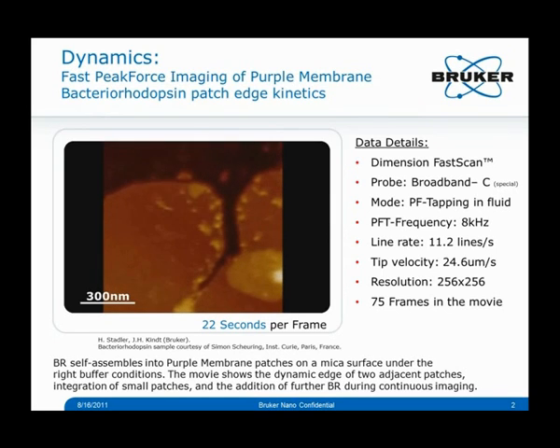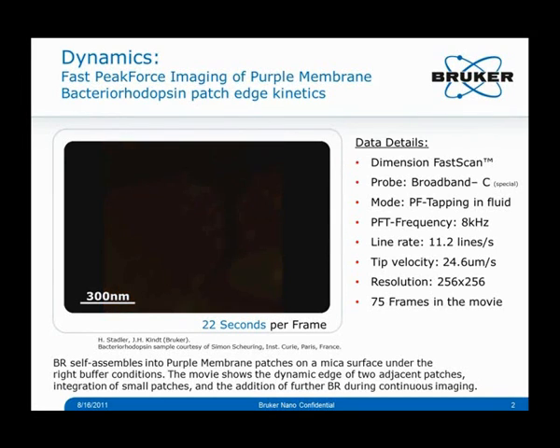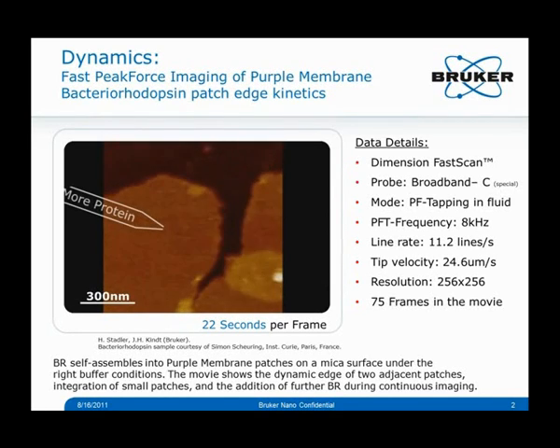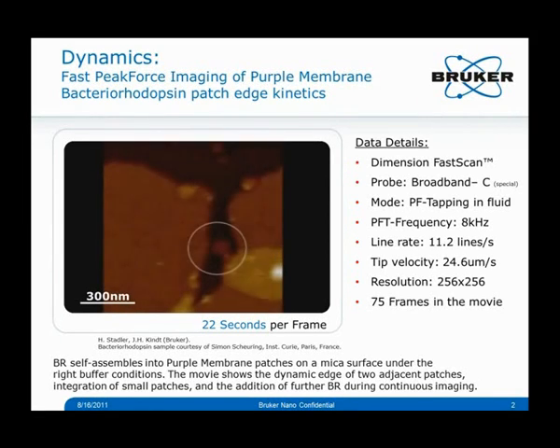So a lot of these particles collect on the surface, and they also seem to be driven close to the edges. Let's watch this one more time. And we see that these little particles are very mobile on the surface, and they tend to move towards the edge, but then they are sitting there. And these are definitely all things that can be studied in a little movie like this.